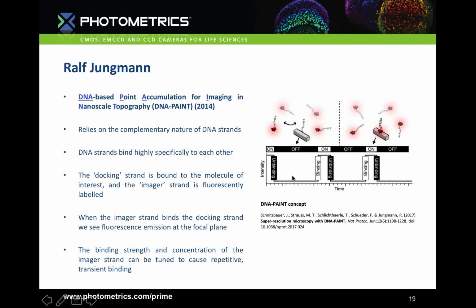The other super resolution localization microscopy technique that I want to mention is DNA-PAINT, which takes the principle of STORM but applies it differently. DNA-PAINT is a newer technique than PALM and STORM, published in 2014 by Ralf Jungmann, and it takes advantage of the complementary nature of DNA strands to produce an effect similar to single molecule blinking.